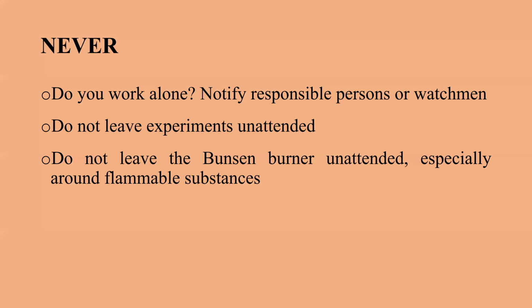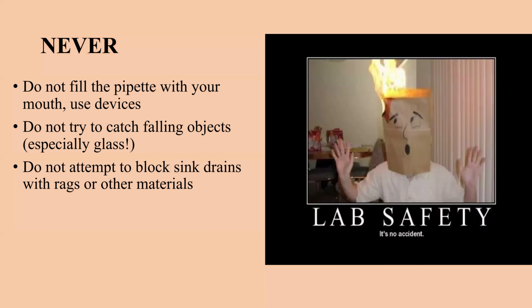And we should notify responsible people if we work alone, because if you're alone, it's very easy to forget something important, like to turn off fire or water. Working devices should be under surveillance, not unattended, especially if you work with open fire.